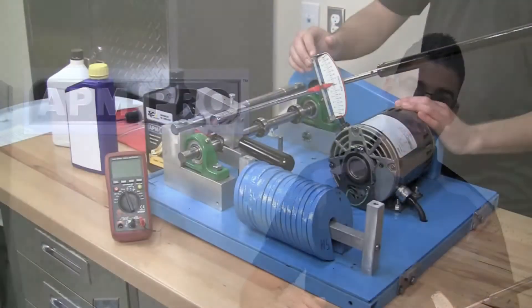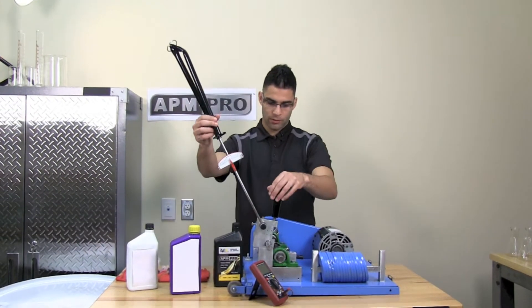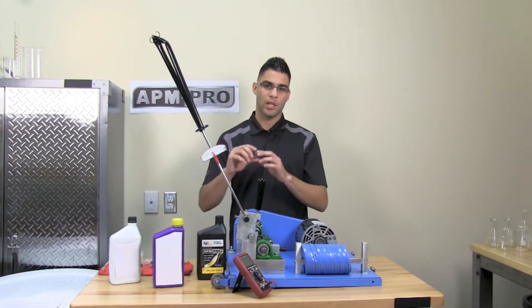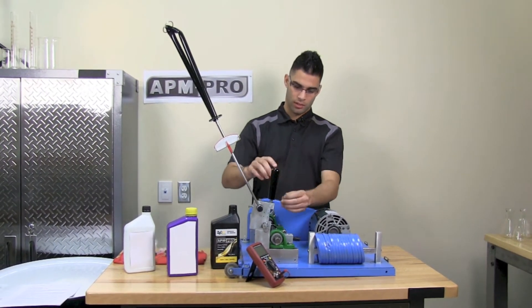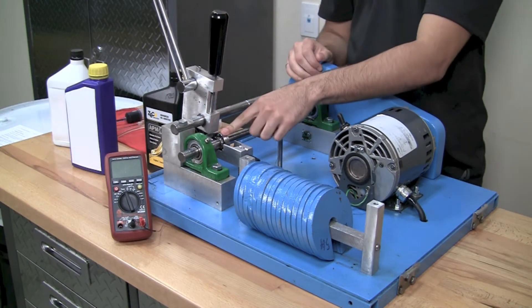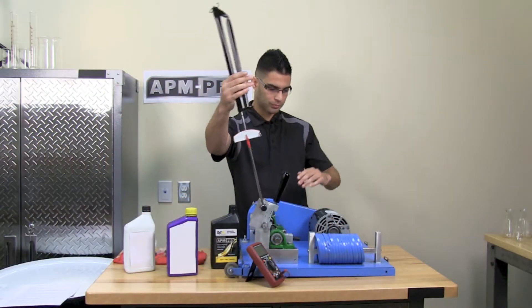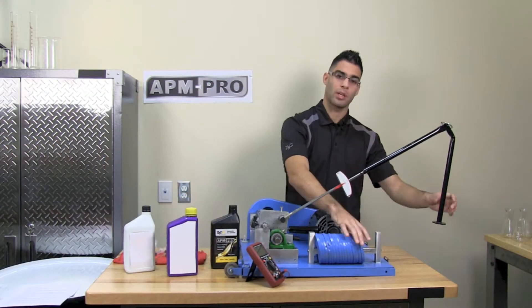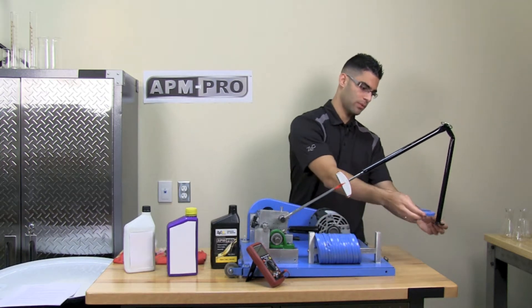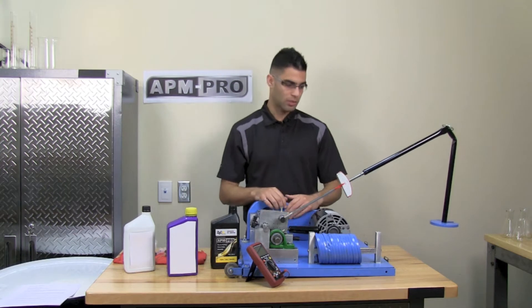We have this test setup that will demonstrate this for us. Firstly, we will be placing a dowel pin acting as our bearing into the machine. It will rub against the race which will simulate metal and metal friction.